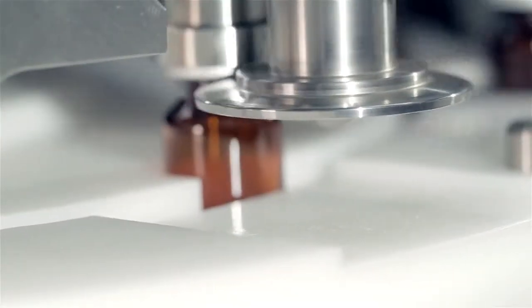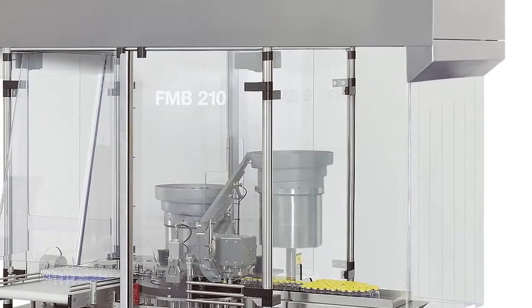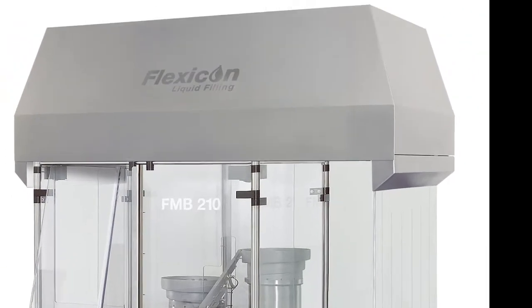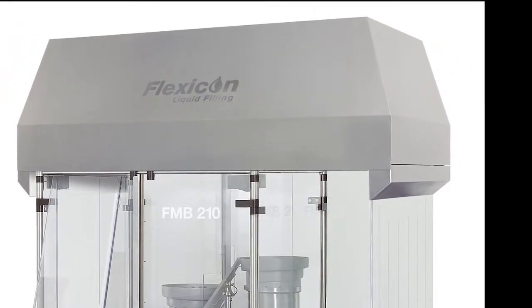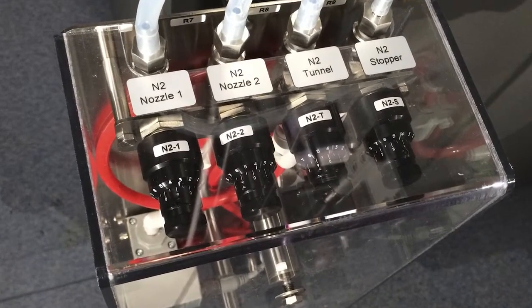The filling and capping line is very compact, configured using standard modules and proven technology. Optional modules include a laminar airflow unit which protects open vials from contamination, connection to a particle counter, and a gas purging system that minimises oxygen content in filled vials.